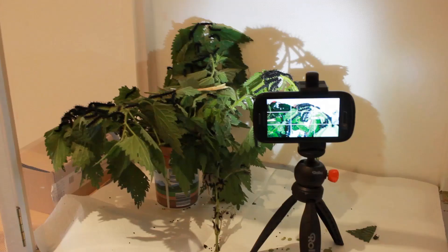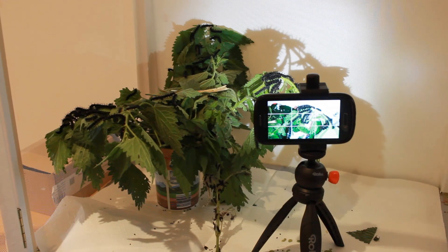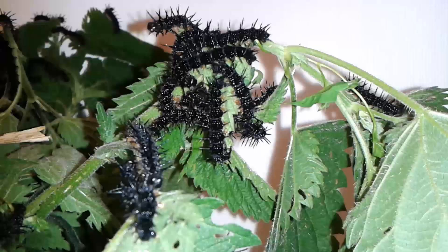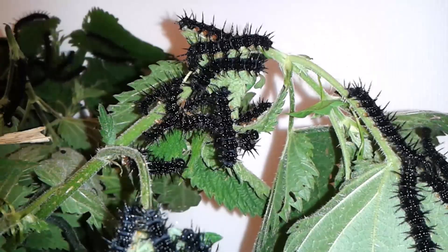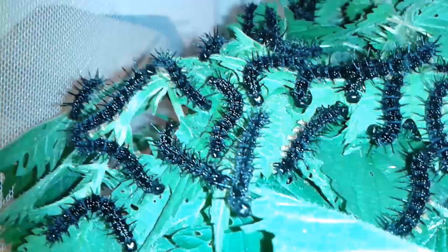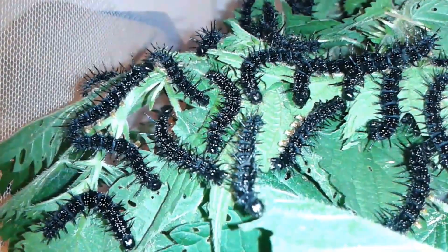We started by collecting some caterpillars and put them together with a stinging nettle, along which we found the caterpillar, into a cage. Here you see a little time-lapse of the caterpillars eating away happily at the plant material. We had to replace the plant material approximately two times every day. Here you can see them again in real time, and you can now see how they were actually eating holes into the leaves.